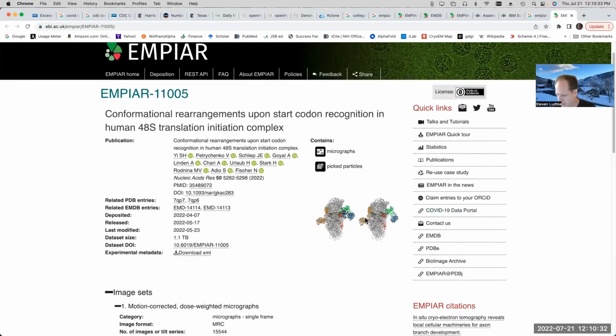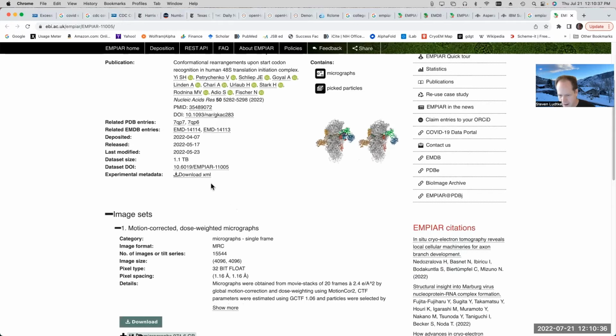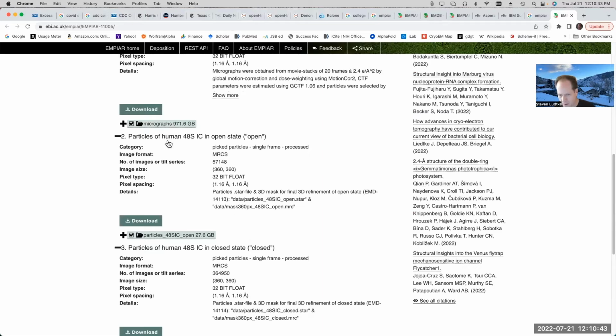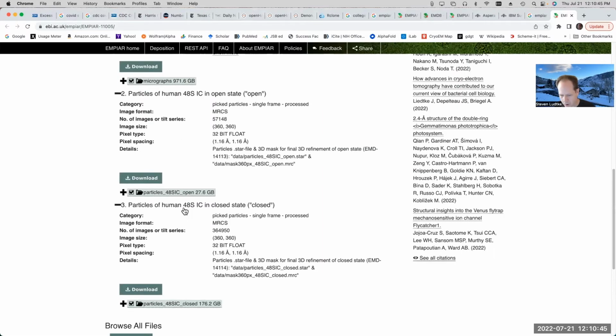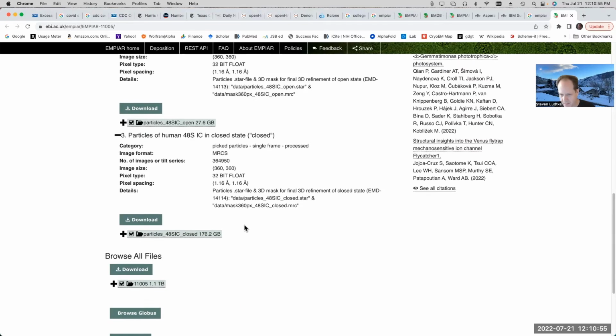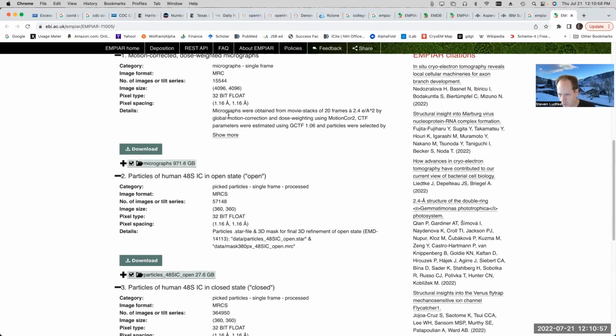I mean, we should at least be able to kind of resolve these two classes from it. But anyway, this is the data set I picked. Now, the overall data set is 1.1 terabytes, but that includes the raw micrographs. If you look at the size of the data from the particles, they're a lot smaller, right? So the small particle data set's 27 gigabytes, and the larger data set's 176 gigabytes. So still a good chunk of data, but not over a terabyte.